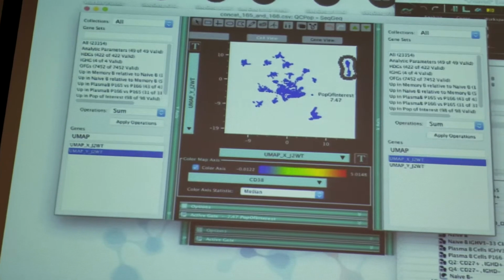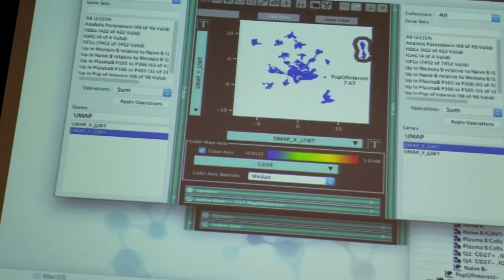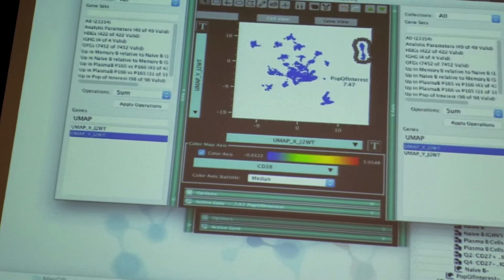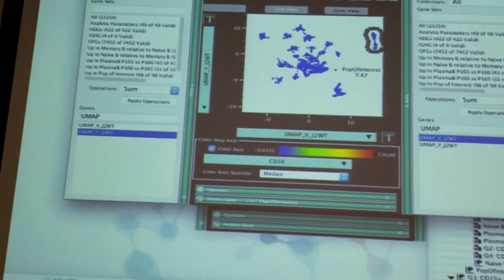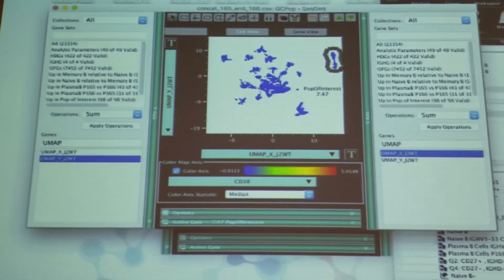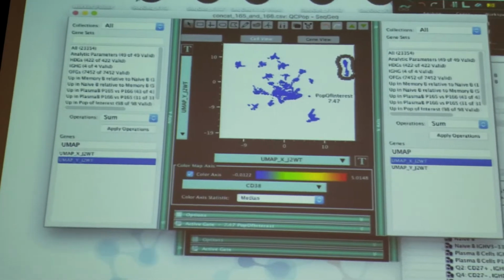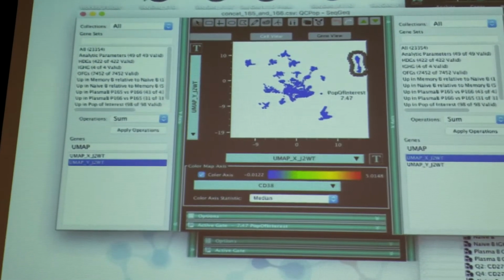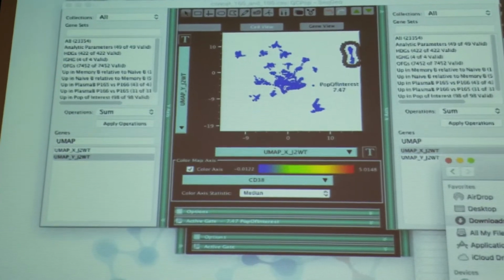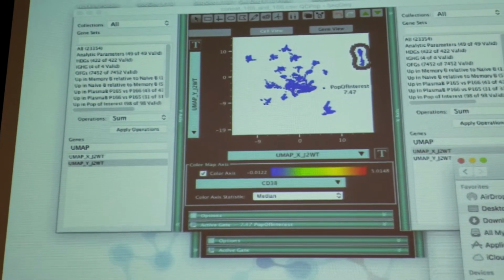Well, you guys had mentioned early on using some kind of gene set to define a population, as opposed to one particular marker. Yeah. It's a great idea. Yeah. But where do you get? I mean, we have some gene sets like that. We could try them out really quickly here. So if I go to my desktop, I think I have a folder here that's just gene sets.